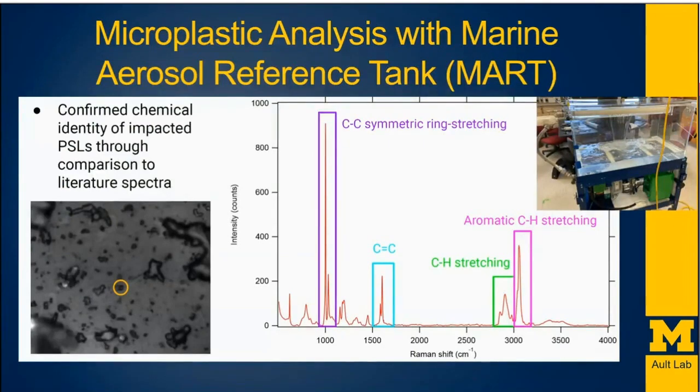And so what we're excited about, we haven't upgraded to be able to do the CH laser in our lab yet, although that's happening in a few weeks. And when that does, we're really excited to compare the CH stretching regions for the Raman and the IR and start optimizing our matching, particularly accounting for things like weathering.